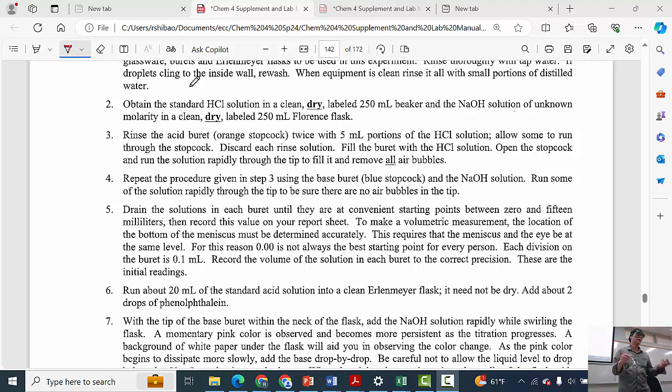Yeah, but that was pink within 1 drop, and I have a 1/4 drop hanging there. That 1/4 drop's already been measured out of here. So what I'm going to do with the 1/4 drop is wash it in with water. So this is 1 1/4 drop. I don't want that. I want it within 1/2 drop. And the color's got to persist for 30 seconds. So let's see if the color persists for 30 seconds.